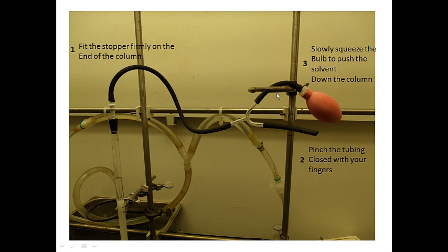Okay? Now there's one thing that happens along the way that I'll save for last, and that is that depending on how well you pack your column, it may take a considerable amount of time for your solution to flow through the column. Some people's columns drip very quickly. Some people's columns drip not very much at all. So in order to give it some pressure and move it a little bit faster, we have designed this little device that will allow you to push the solution, in essence, through the column.